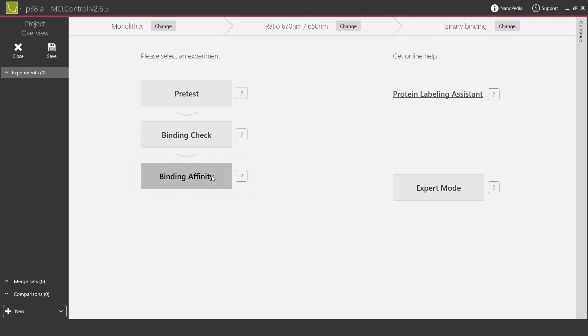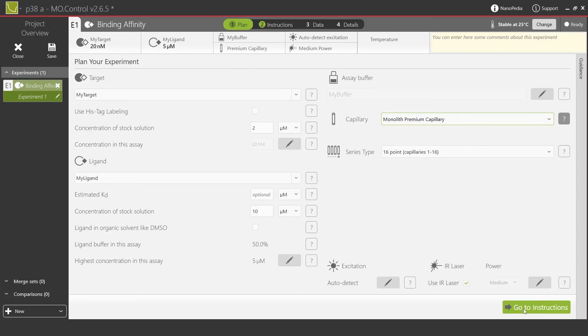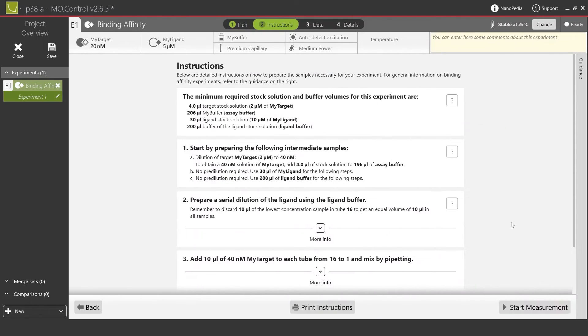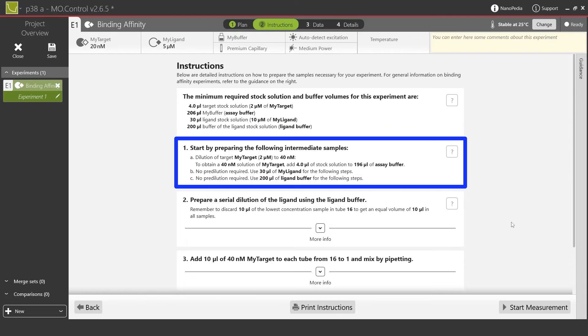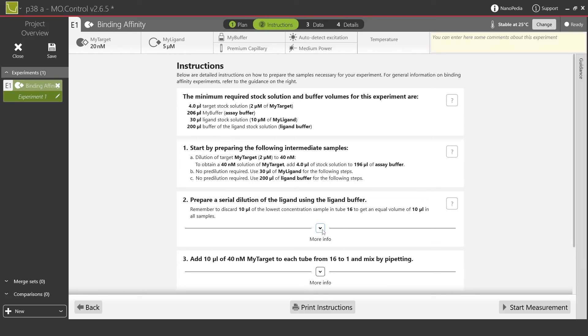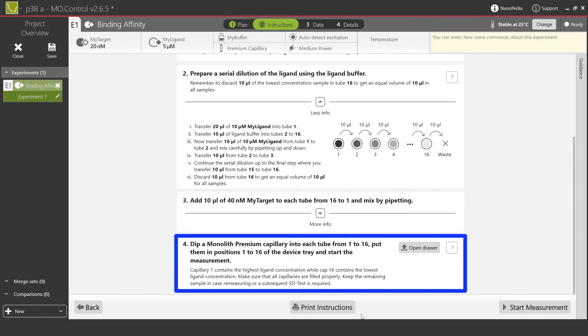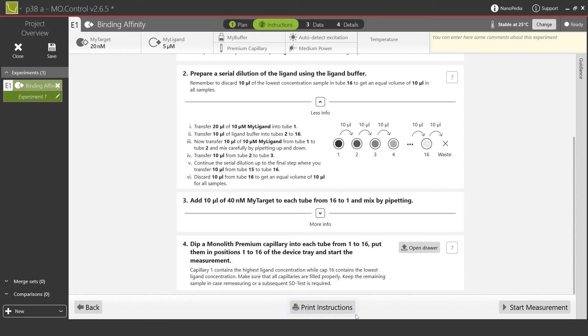If you choose to add Monolith X to your lab, our team of PhD scientists will help teach you how to set up all sorts of creative affinity experiments. Once you select the experiment type, you'll move on to the plan page, which allows you to name your components, enter their stock concentrations, and list your buffer recipe. Once that information is entered, you move to the instructions page. The instructions page uses the information from the plan page to give specific step-by-step pipetting instructions using experiment-specific molecule names and concentrations, adapted to the chosen experimental mode and stock concentrations. There is an option to print your instructions or paste them into your lab notebook. You have now completed the preparation phase and are ready to start your measurements.